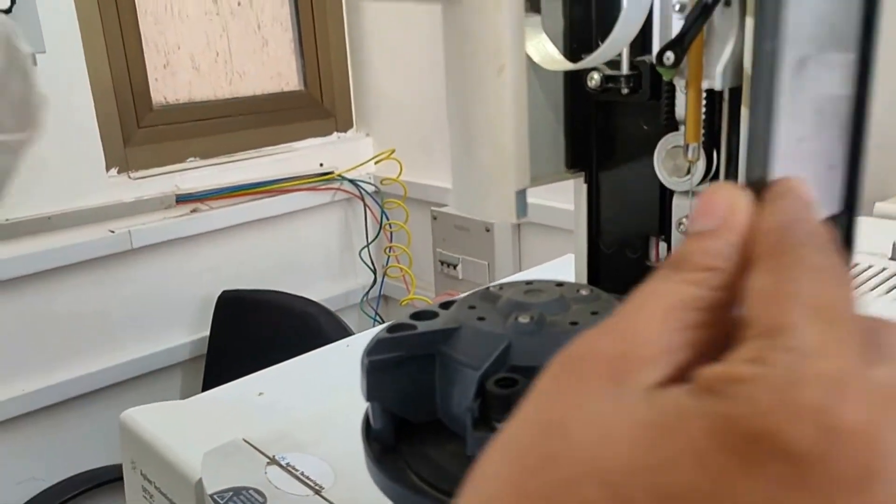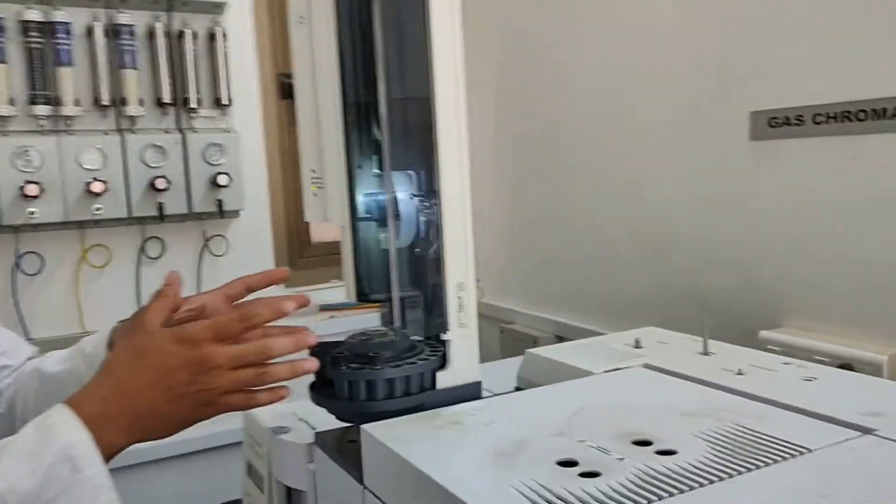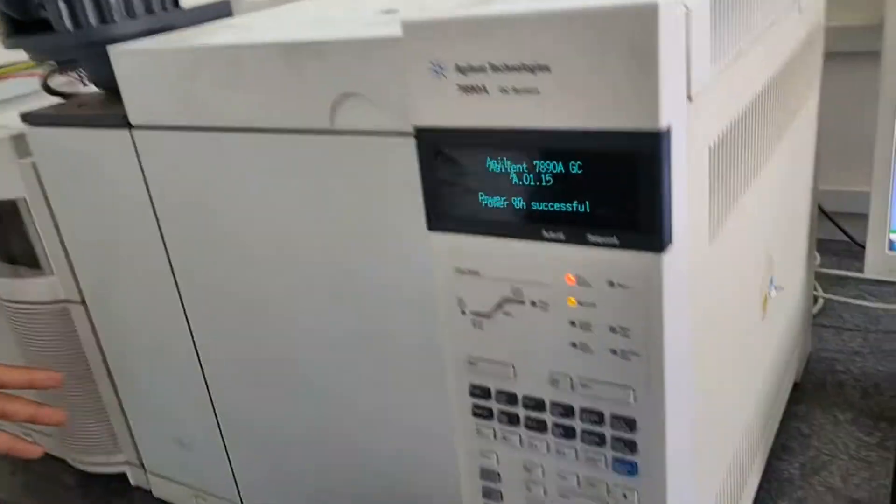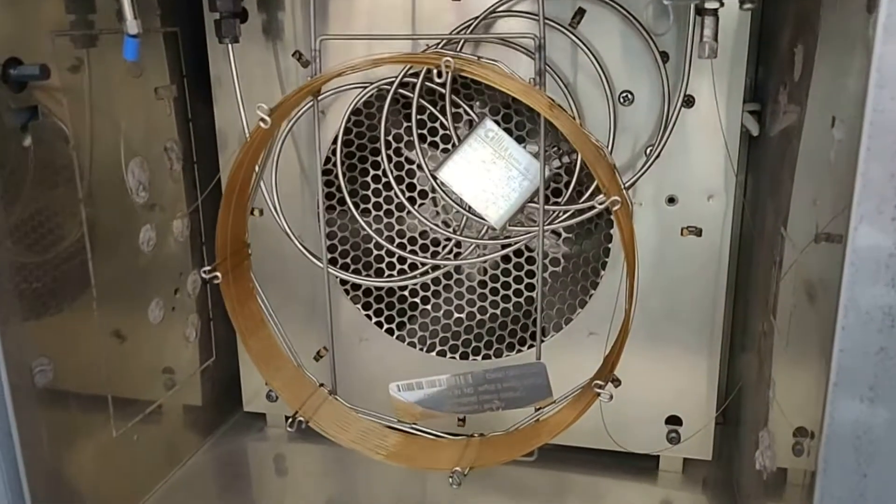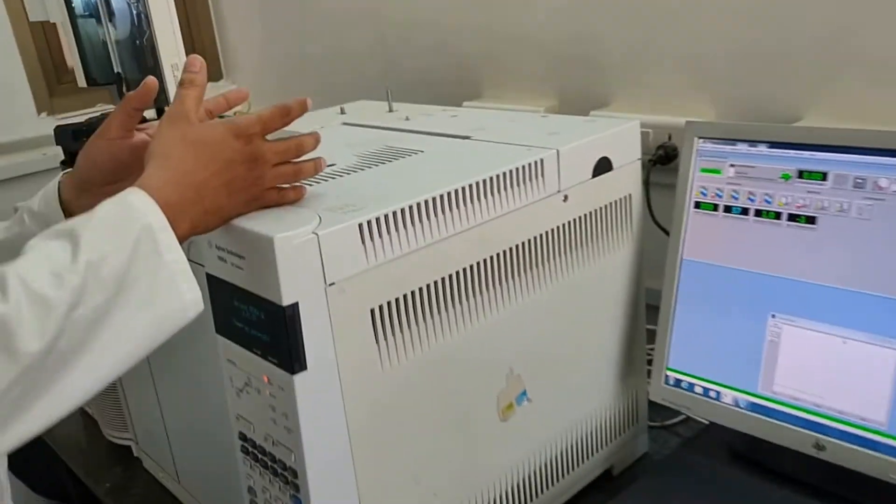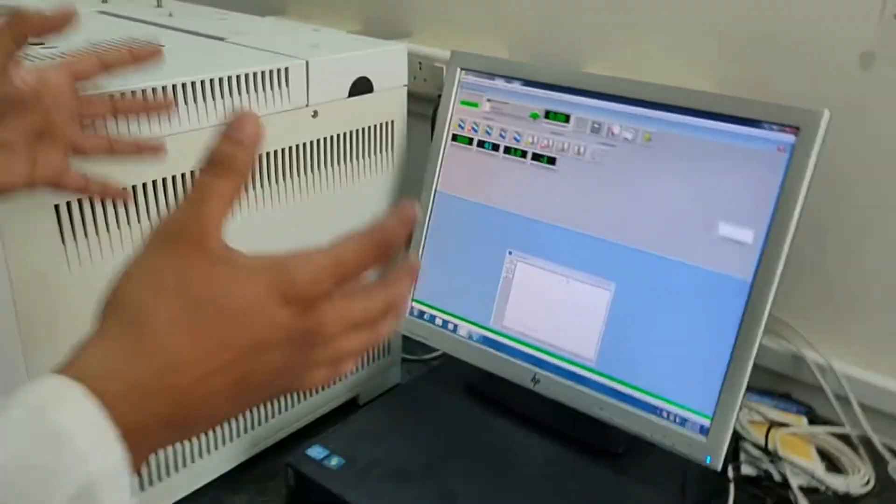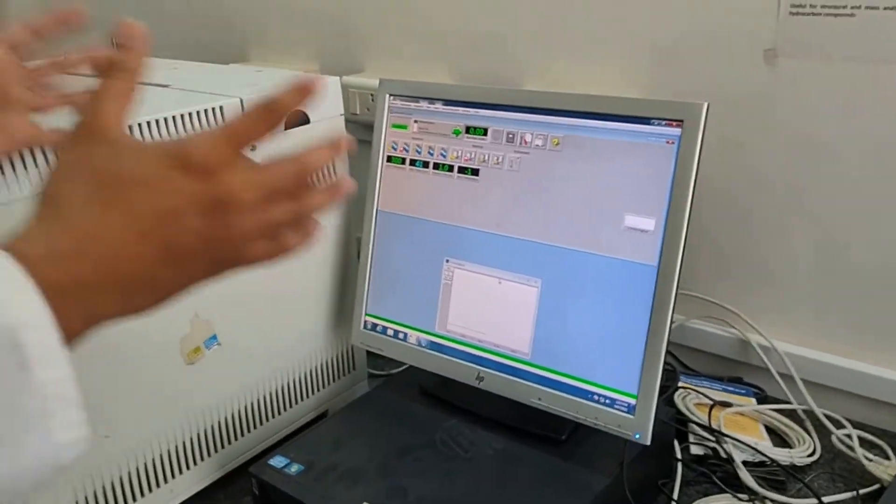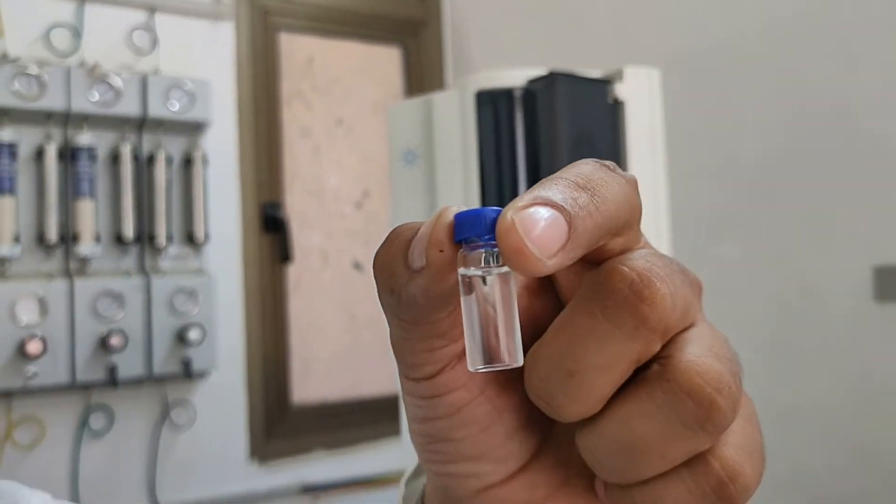Now this is the inlet part. After that our sample is inlet here with the instrument. Now it is going to the column part. This is our column in our instrument. You can see here, the two columns are connected. Now then it is going to the FID detector part, and then we are getting the signal catcher by using computer system software tool. We are operating this instrument. Now this is the sample bottle, it is called the GC vial. Its size is 1.5 mL.